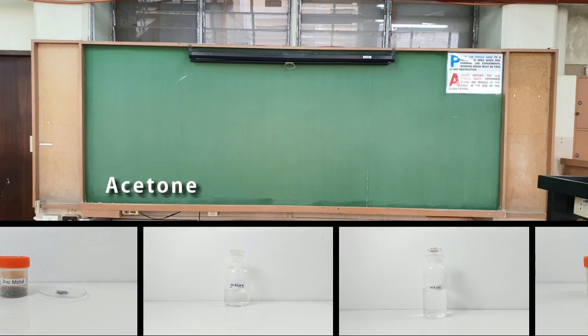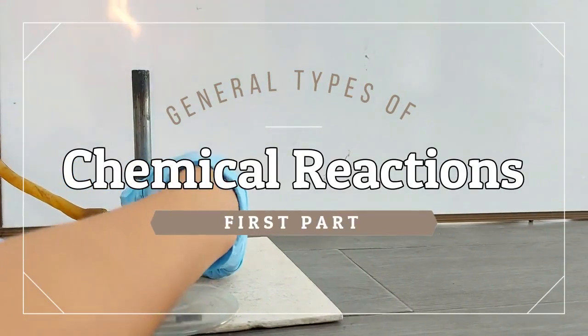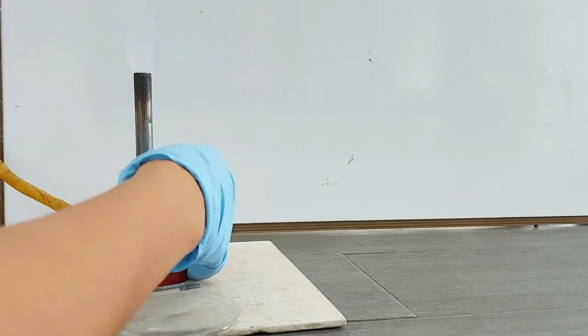This experiment is divided into two parts. Part 1. General types of chemical reactions.